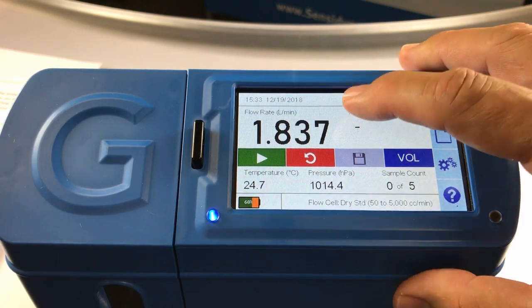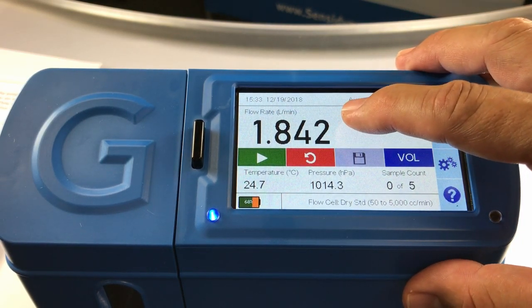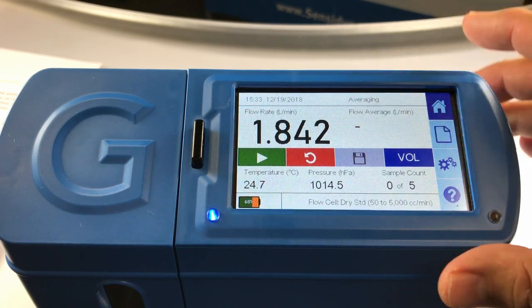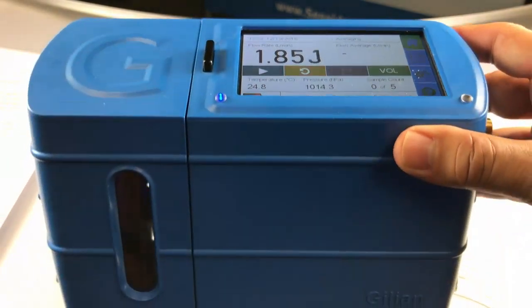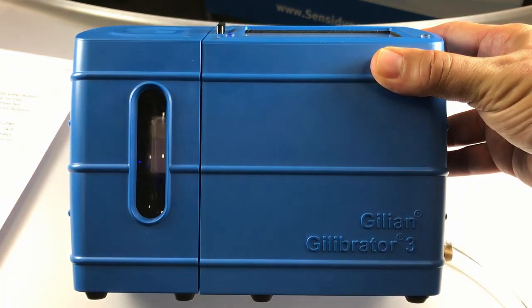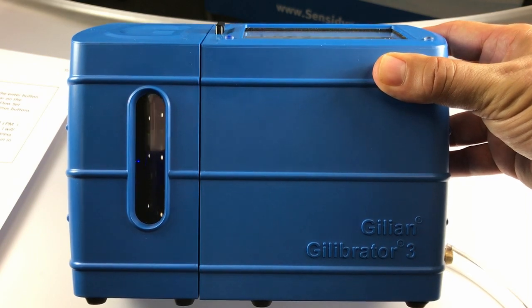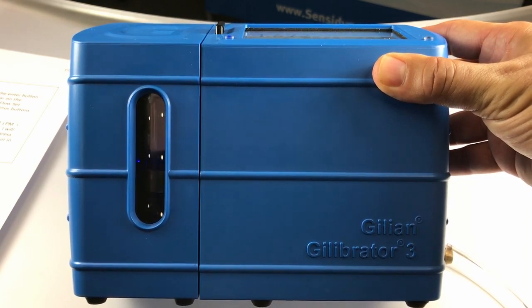You will now notice that live readings appear on the Gillibrator 3 home screen. You will also notice that the backlight on the flow cell window is now on. You can see the puck oscillating in the calibration cylinder.